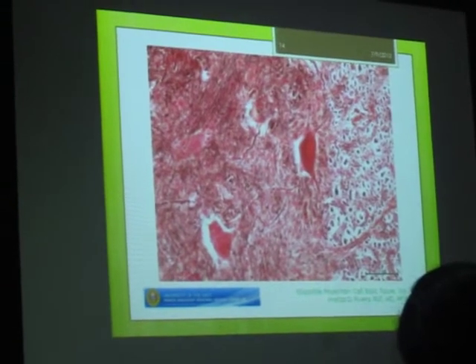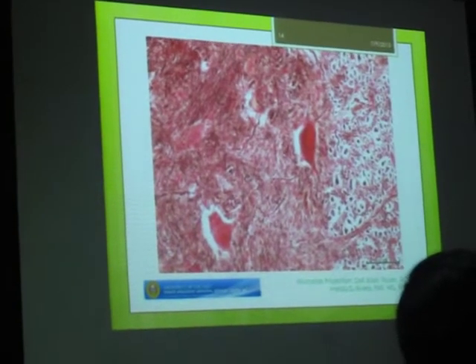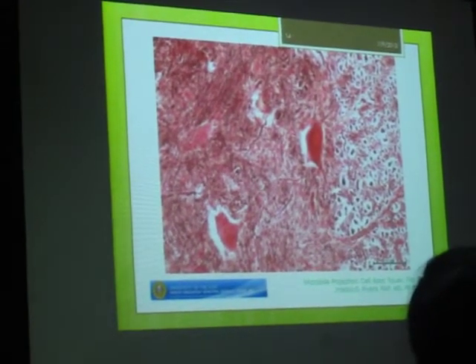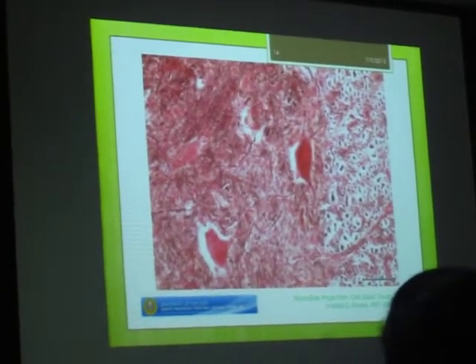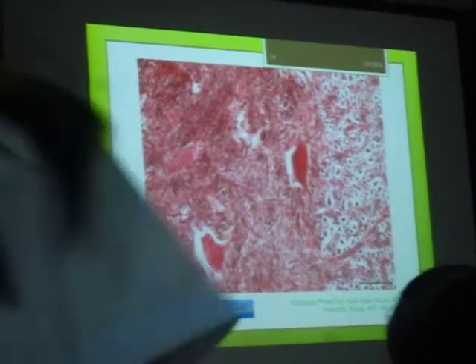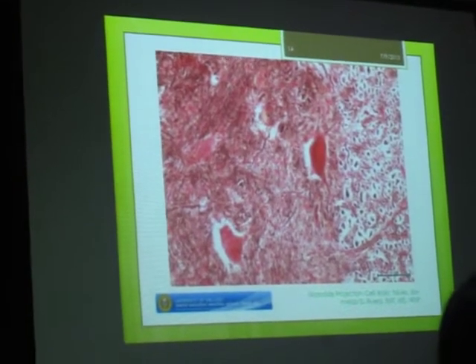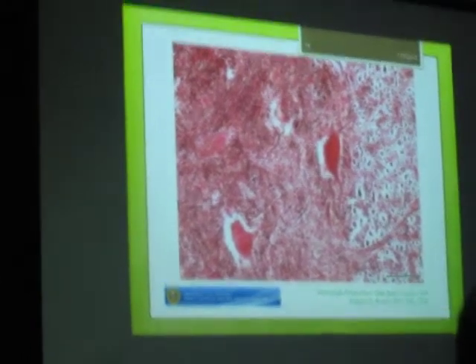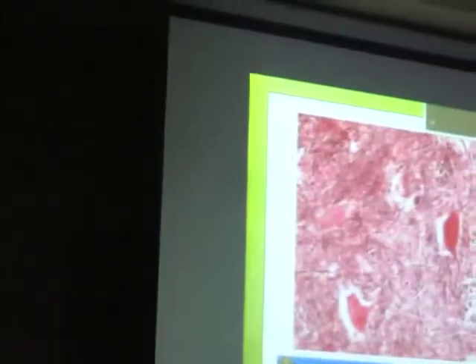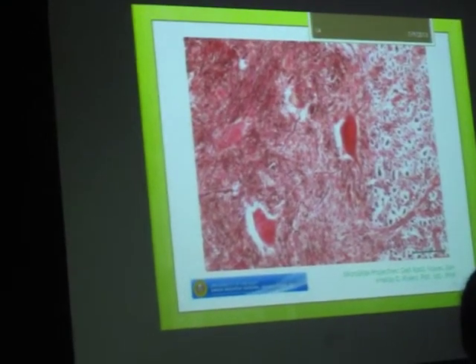Okay, as for the other types of neurons, like your pseudo-unipolar, bipolar, you don't actually see the processes. It's hard to identify those processes under the light microscope only. So what does it imply? If it is hard to identify, if you don't see it, we don't ask it. Unfair naman, di ba? It's unfair if you cannot classify it.